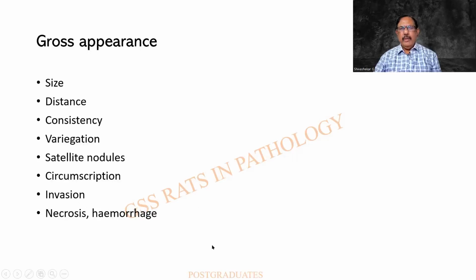Again, we are all having mounted specimens or formalin-fixed specimens which will be uniformly grayish white. But if they are treated with ethanol, the original color, it is said, may be retrieved.